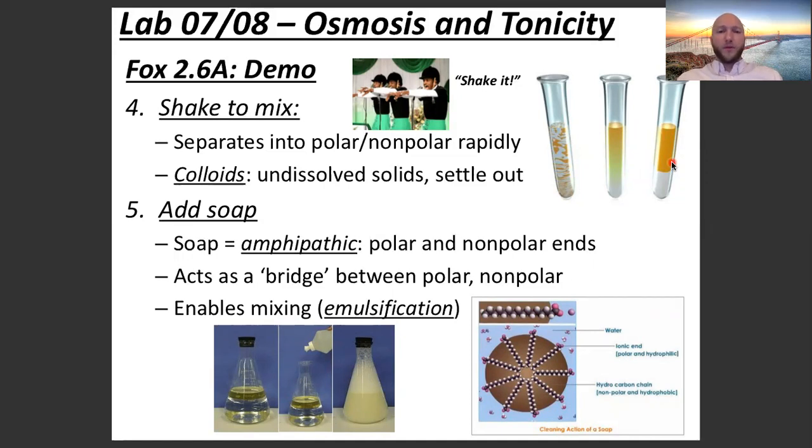Polar mixes with polar, nonpolar mixes with nonpolar. Next up, we're going to add a soap. I told you we're going to talk a lot about soaps and amphipathic molecules this semester. So what does amphipathic mean? It's come up a few times. It's underlined and bolded. It is a vocab word.